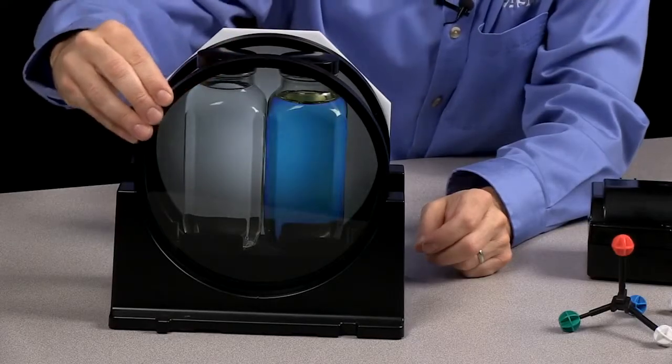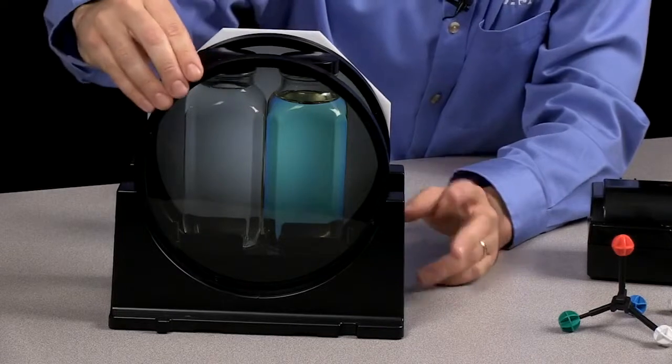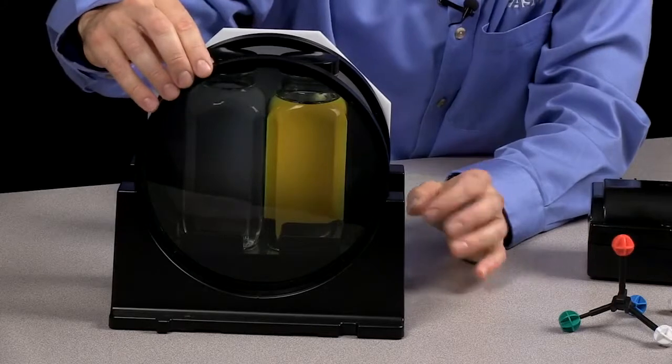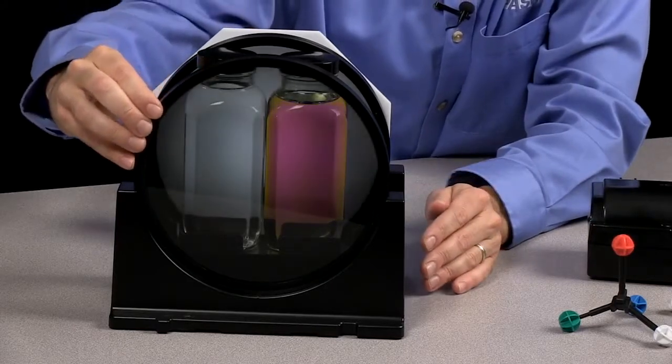So now, as this is getting darker, this is getting brighter, different colors are starting to appear because of the different wavelengths of light that are being blocked or let through by that particular sample.